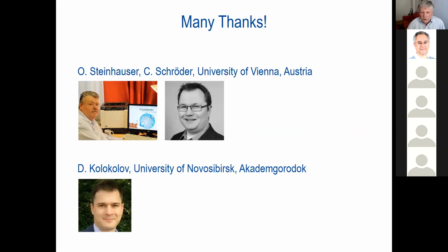With that, I would like to end my talk, but I would like to say many thanks to Ottmar Steinhauser and Christian Schröder. That is an ongoing cooperation, where we just published this paper comparing fast field cycling data with MD simulations. We just identified new systems which are more complex than the simple one we have chosen, where we mainly addressed the proton relaxation of the cation, leaving out the anion. I would also like to thank Daniel Kolokolov from the University of Novosibirsk, Akademgorodok. That is also an ongoing cooperation. We try to get these coupling parameters from solid state experiments, and also dynamics in the glassy system down to very low temperatures, to see how the coupling parameters and the dynamics of the systems behave there.